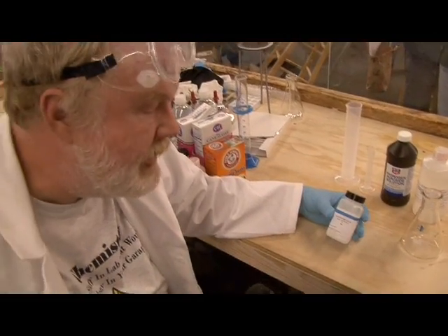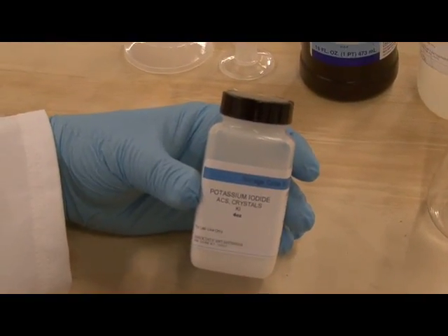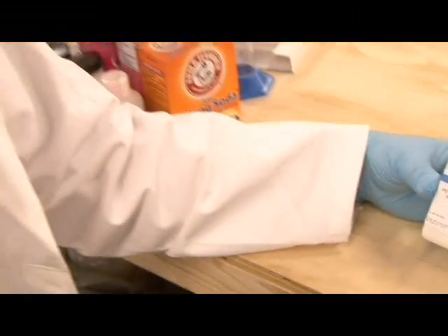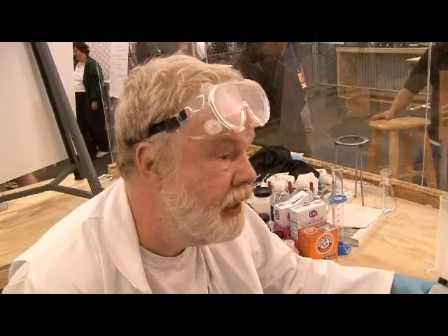What we have here is called potassium iodide. It is basically an uncontrolled chemical. I could order a ton of this stuff — literally — have it delivered to my house, and the only one that would raise their eyebrows would be my wife. There's just no paperwork to be done on it or anything.